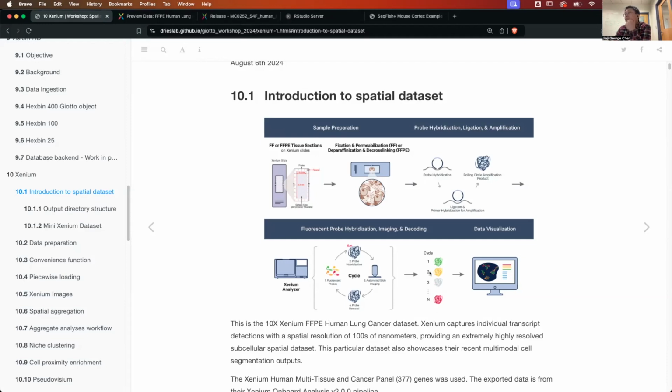Across different cycles, you get different flashes of light because of different fluorescent probes that are binding in sequence to your barcode. And this is basically going to be decoded as individual ons and offs that encode for a particular gene that you have in your design panel. So that's how this works.